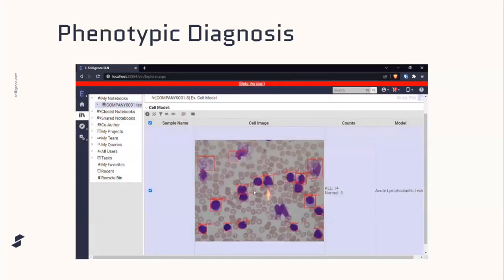Yeah, so right here in this data set, it's kind of binary. This will be different in use case when it's finalized, but in this case, the model only tags them as either acute lymphoblastic leukemia or normal. This will be incorporated into the general blood data set, so it would be more specific with the red blood cells in the background. In this case, it was just tagging leukemia.